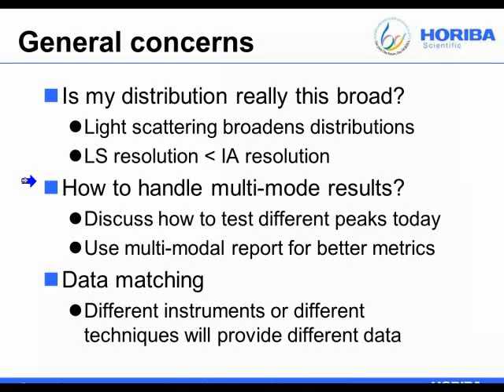I did get a few questions about how to best handle multimodal distributions. I'll discuss today a little bit about how you can test whether different peaks may or may not be real. And laser diffraction products and a few of the other technologies have built-in multimodal reports.